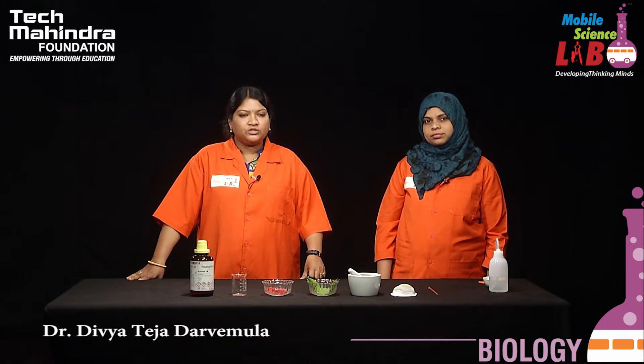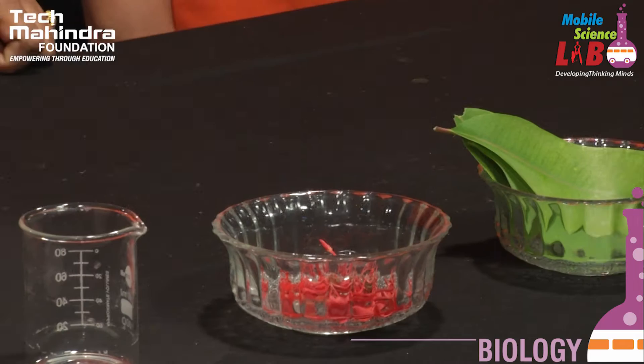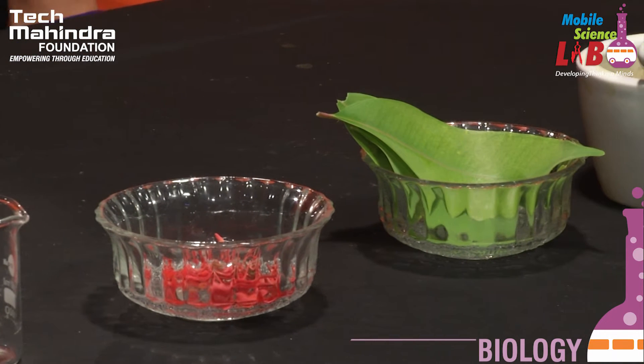Hi students, today we are going to perform a beautiful experiment on paper chromatography on behalf of mobile science laboratory experimental activities. We'll see how we can extract the plant pigments present in leaf and flower by paper chromatography. You are all very much familiar with chromatography.